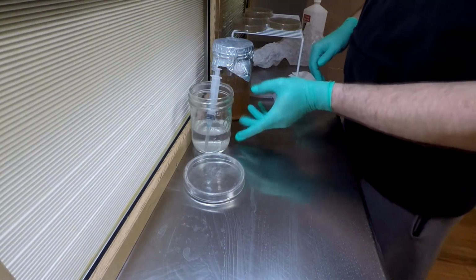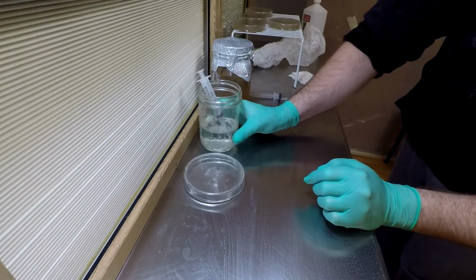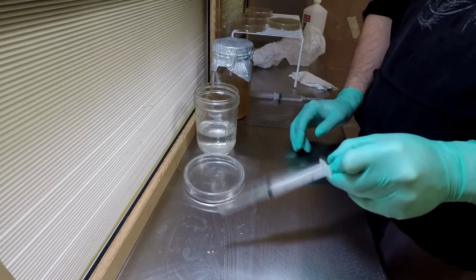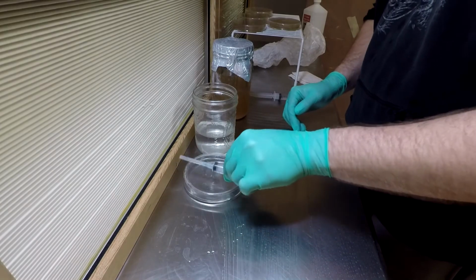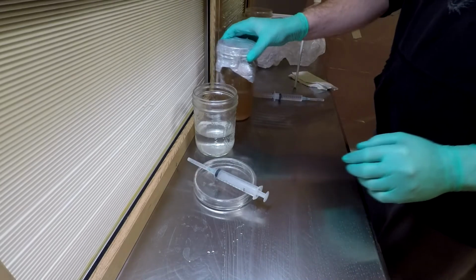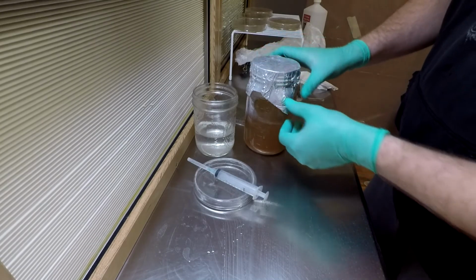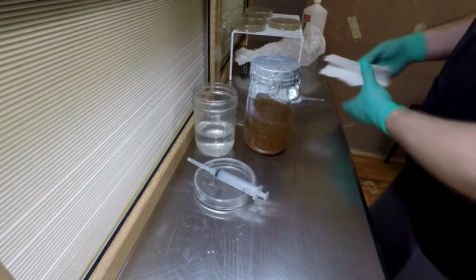You can see I have this jar of water. I filled it up to about 200 milliliters. I'm going to take the syringe out that's been pressure sterilized. Stay there for a moment. I have here a jar of my standard liquid culture recipe, which I'll get into again when I start making more jars of liquid culture.